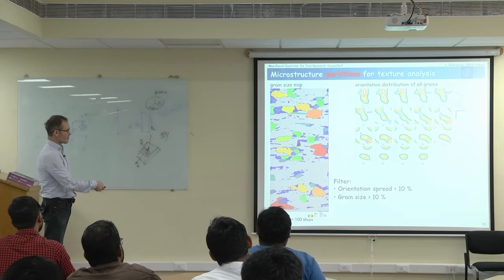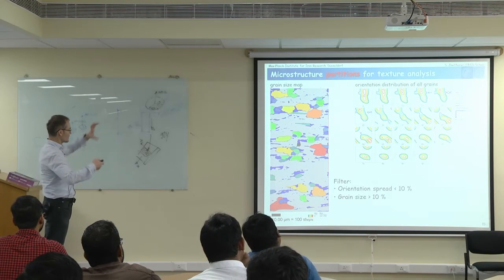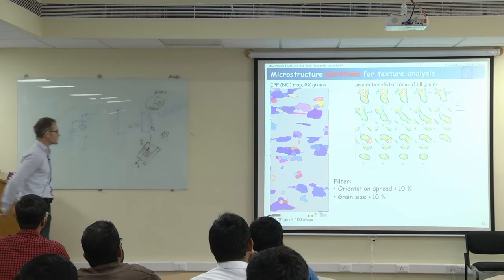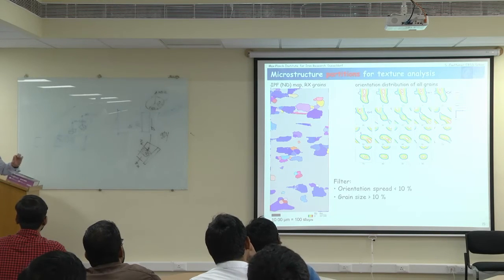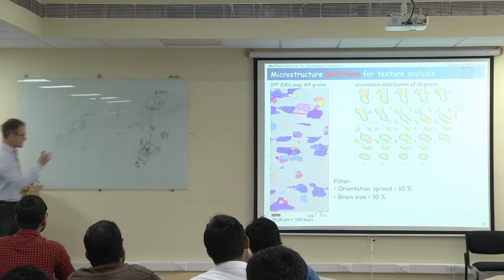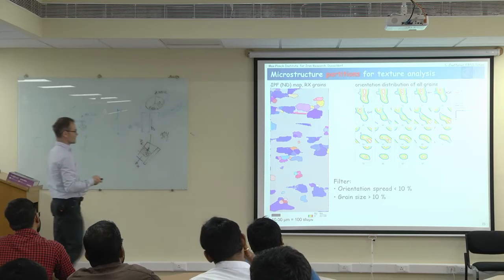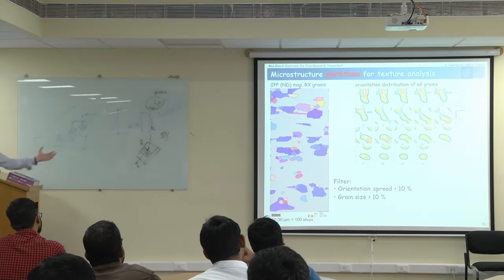This filter we will call grain size. The grains should be larger than a certain range. At least all these big grains I want to pick. So I let that filter. And now it looks like a proper filtering. All this little garbage here has been filtered out. There may be a little bit of mistake. Some of the nuclei I will miss, but it doesn't matter. Mostly I do a right analysis, and now I actually have a clear separation of the deformed structures and the non-deformed structures.